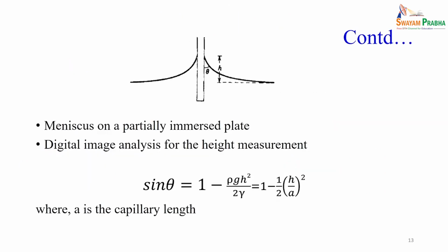So, further, let us say this is the meniscus on the plate, this height is touching up to the edge, and this angle is theta.